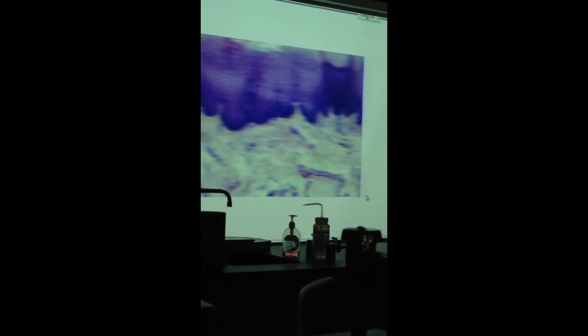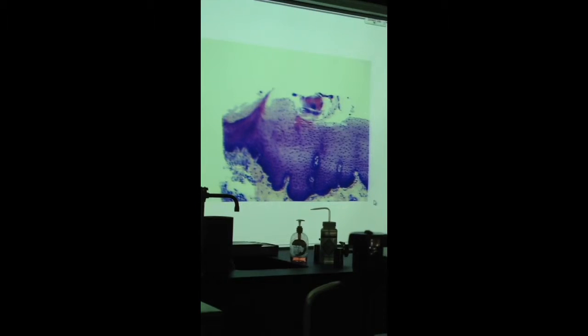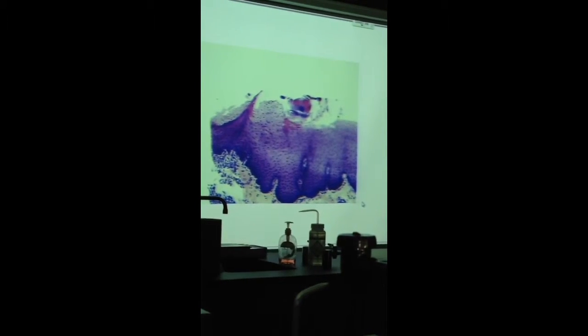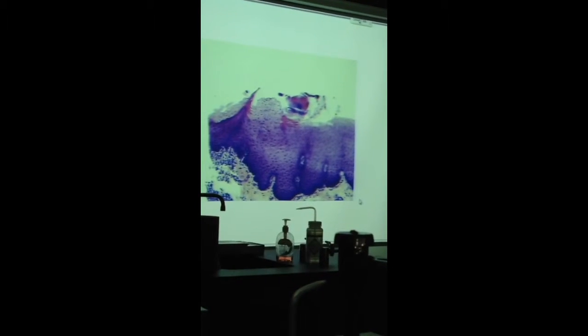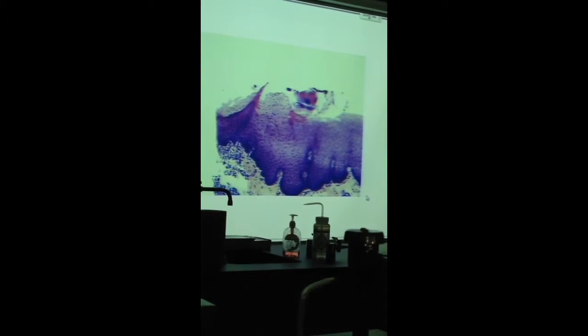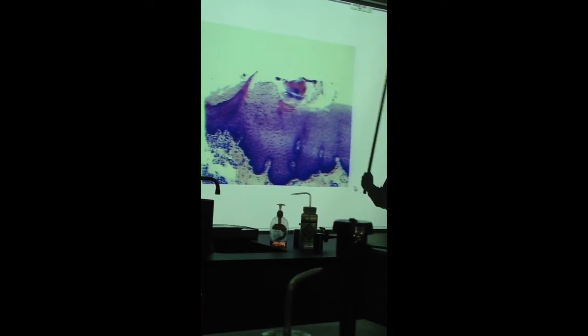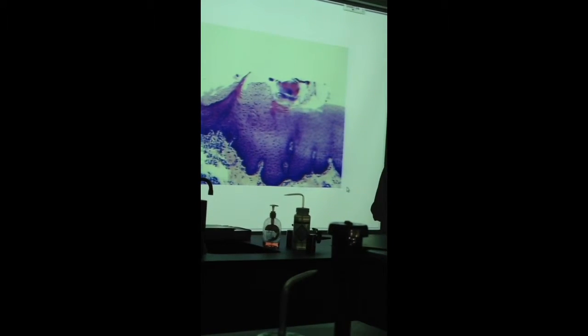You can see them on the surface of the human tongue. We've got another one right here, and this is called a filiform papilla. You can see they're sharp and spine-like. No taste buds here. These are the smallest and the most numerous of the papillae, but no taste buds associated with them. Instead, what they do is they give the tongue a rough surface. In other words, they increase the grip of the tongue so it can better manipulate the food.